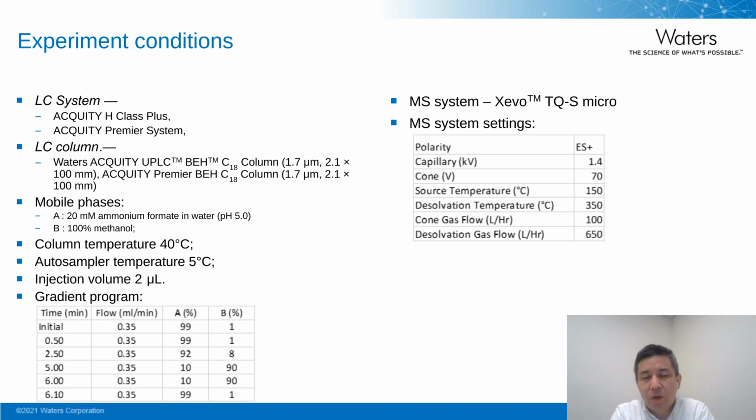We also used two columns: the Waters Acquity UPLC BEH C18 column and the Acquity Premier BEH C18 column.